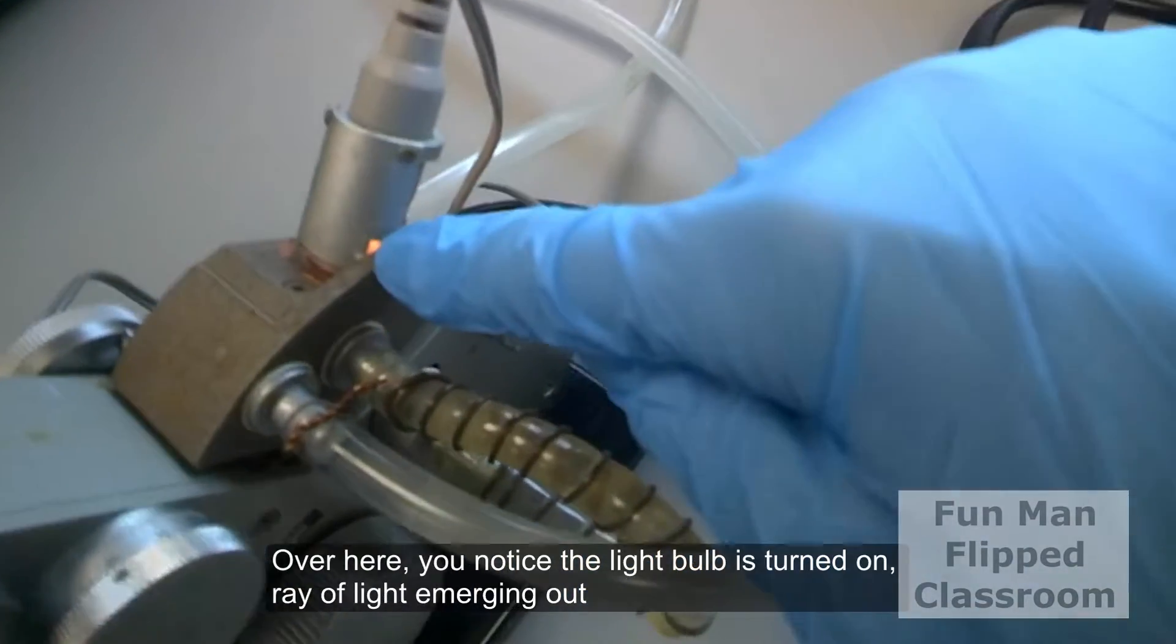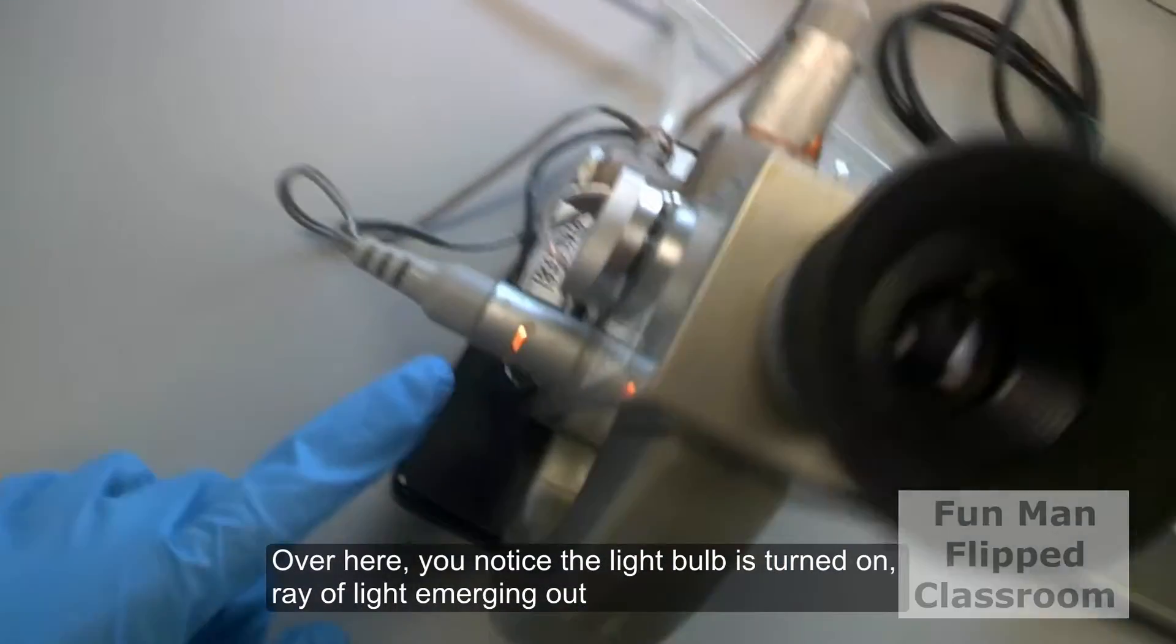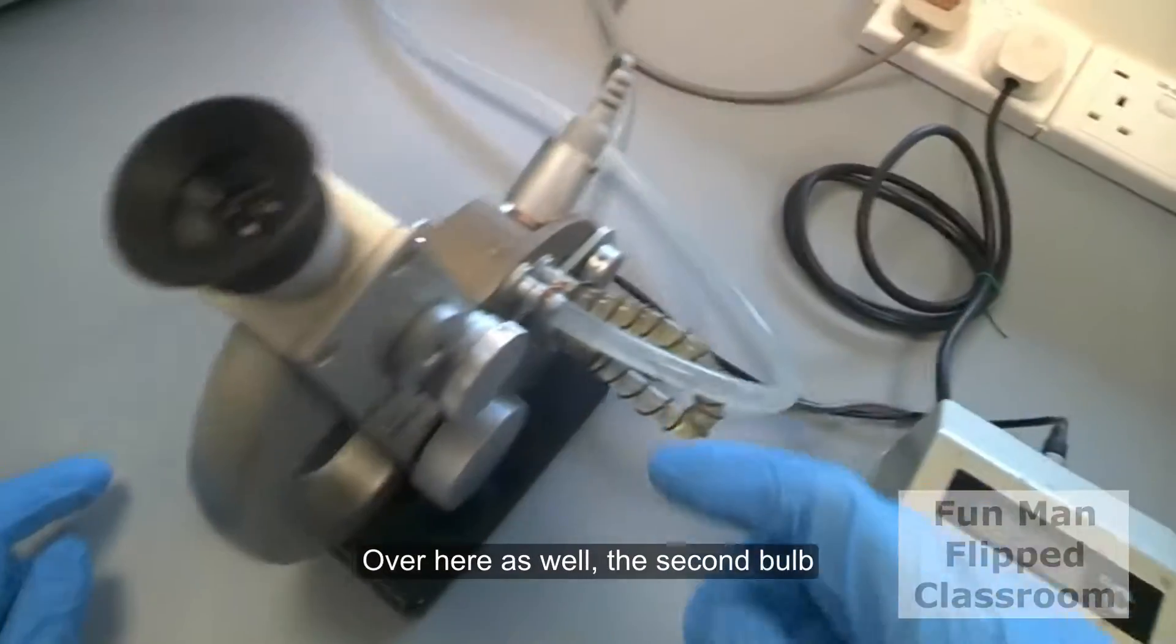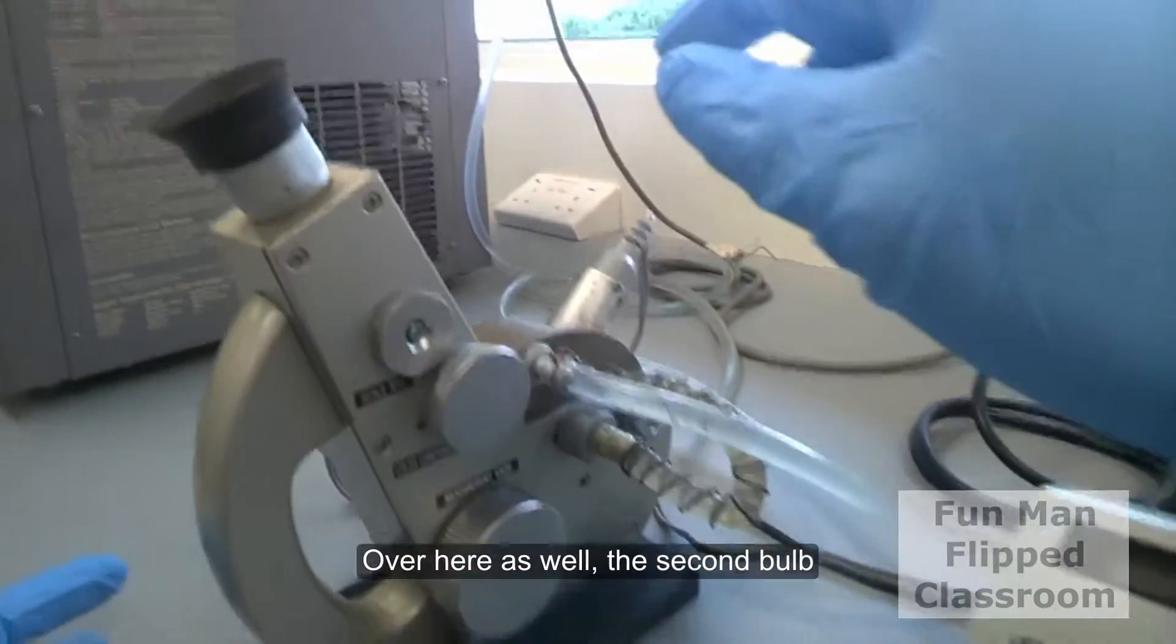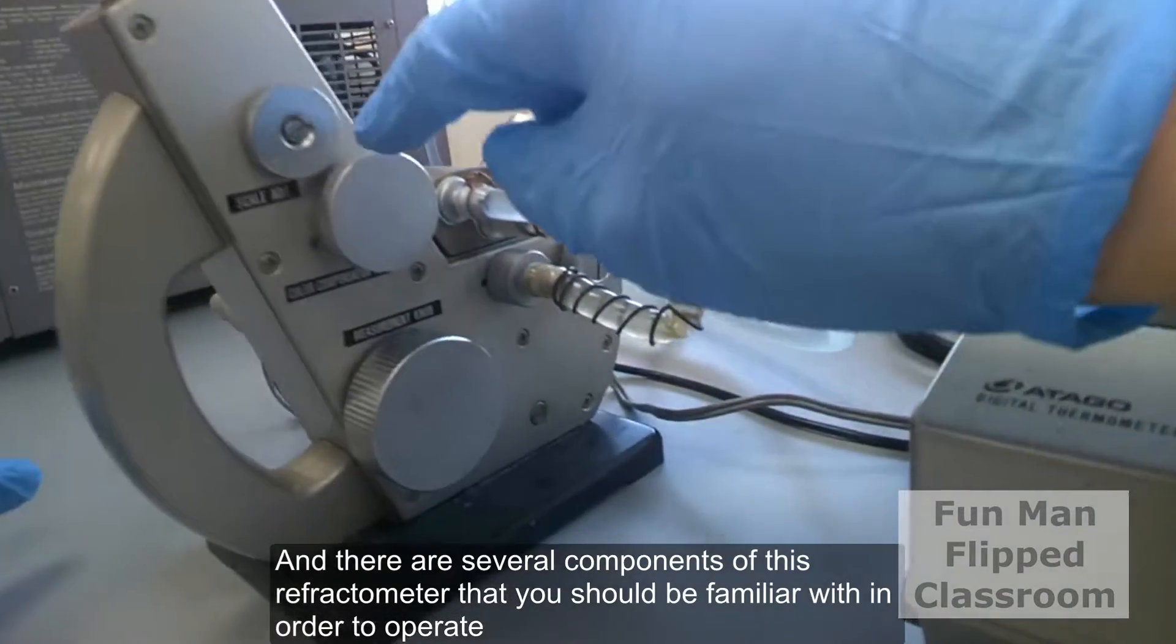And over here, you notice the light bulb is turned on, the ray of light emerging out. And over here as well, the second bulb. And there are several components of this refractometer that you should be familiar with in order to operate.